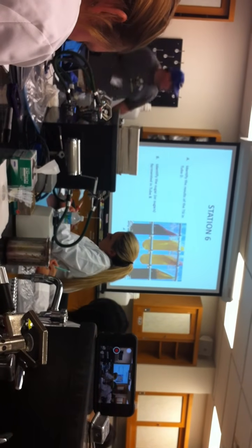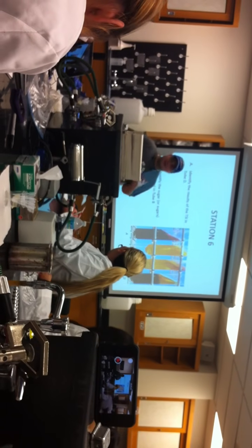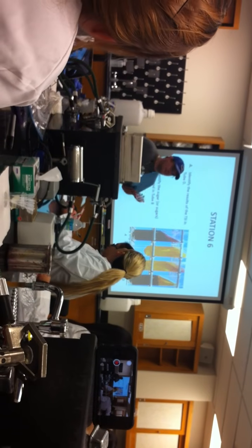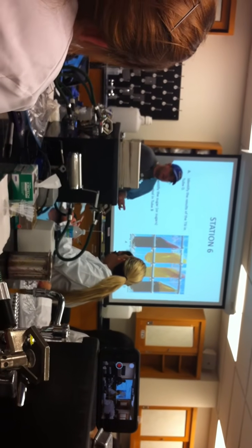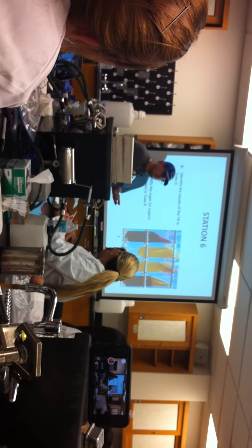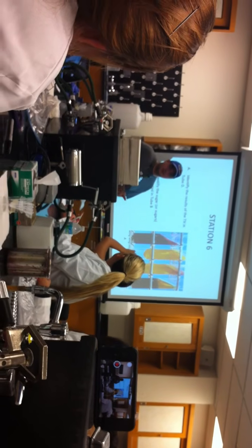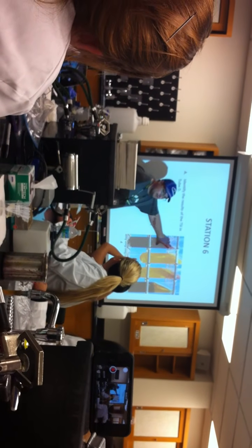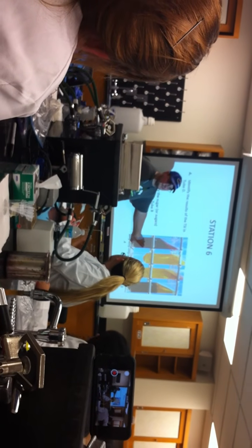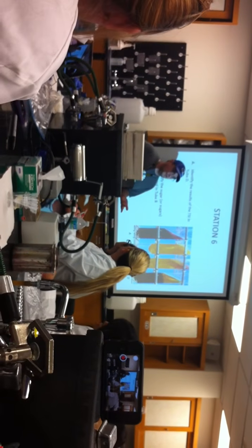So if it just has the ability to ferment the bottom, what does that tell you? It can't ferment disaccharides. Okay? It can only do single sugars. Make sense? This is the level of understanding I want you to get to. If it can't do the top, and the top has disaccharides, but it can do the bottom, which is single sugars, you say it can ferment single sugars, but it can't ferment disaccharides.